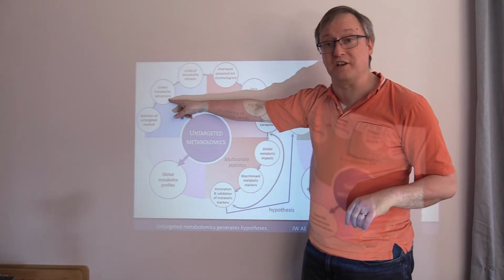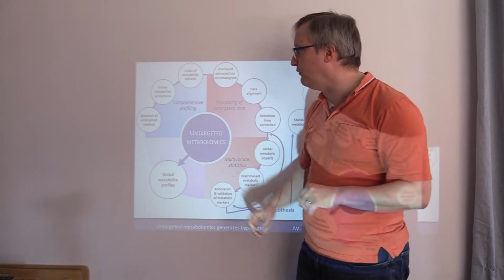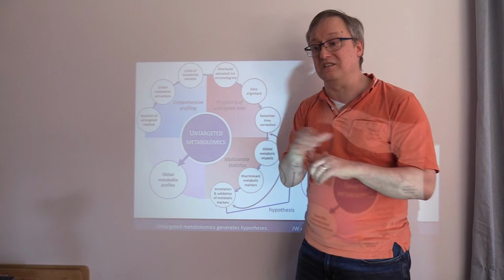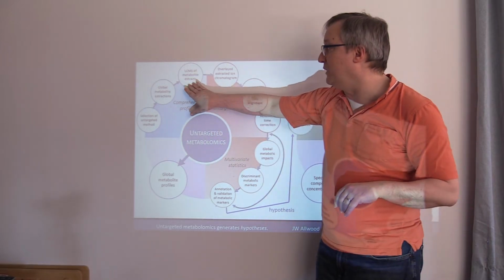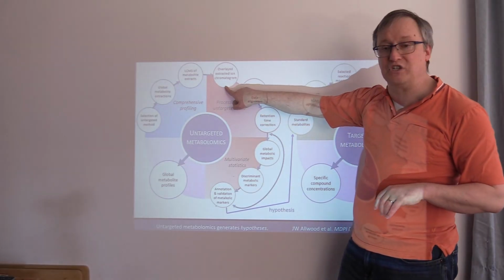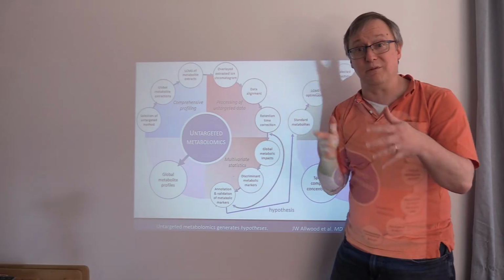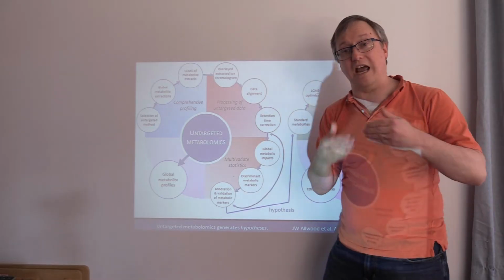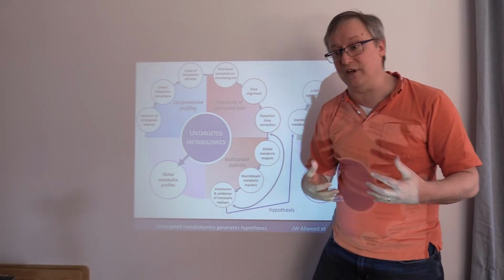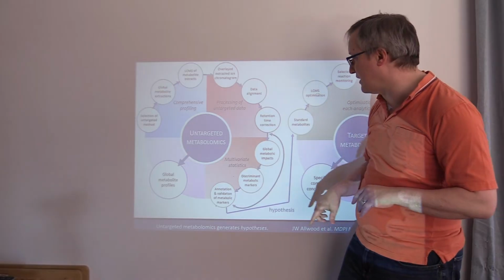The extraction processes we use are not specific to one metabolite or a handful. The extraction processes need to give us a good cross-section of all the molecules of that type. We can do our LC-MS. We generate extracted ion chromatograms. We need to align those chromatograms to be able to do relative quantities and so on. We also need to understand how much the chromatography has shifted from one experiment to the next. That gives us retention time correction.